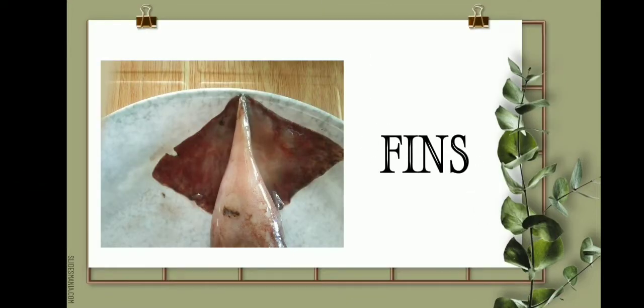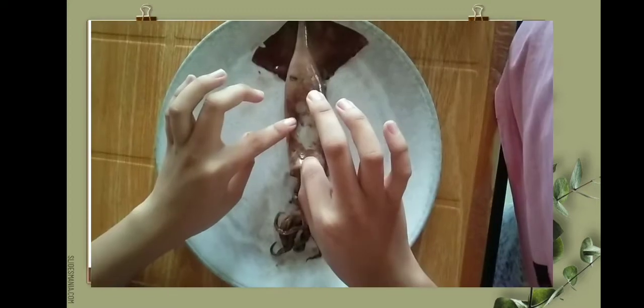These are the fins. Fins are the two triangular parts at the squid's end, like their tails. These fins allow the squid to steer themselves and to stabilize their position. It stabilizes their movement, especially when swimming underwater.